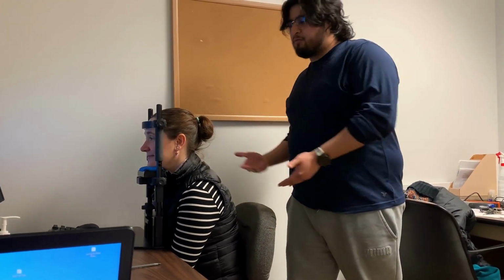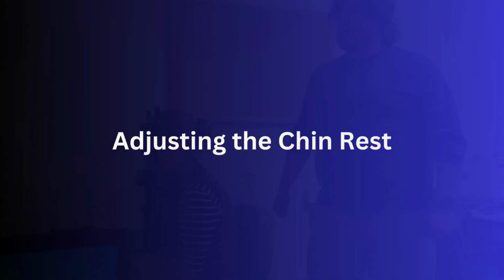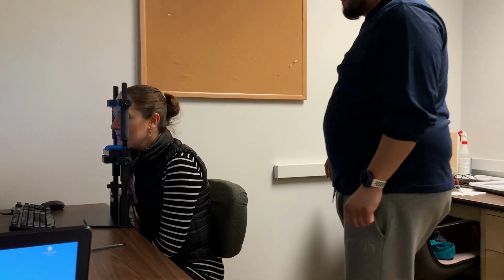And you want to let your participant know that they may be sitting here for an hour, hour and a half, up to 2 hours. So ask them, will you be comfortable here for a long period of time? Yes. Okay. Are you comfortable in this position? Could it be a little higher?